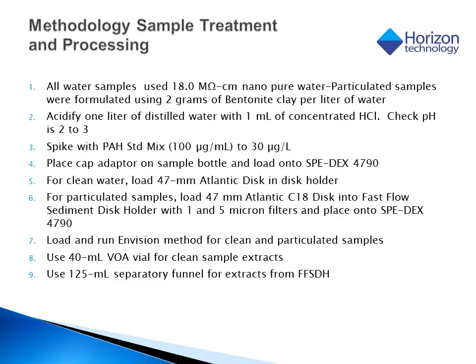The samples with bentonite clay were extracted using the fast flow sediment disc holder and the 8-second rinse technique on the extractor. The 8-second rinse technique was necessary because of the increased surface area of the pre-filters used on the fast flow sediment disc holder. The 8-second rinse technique resulted in more solvent, acetone and hexane, being used to extract the disc.